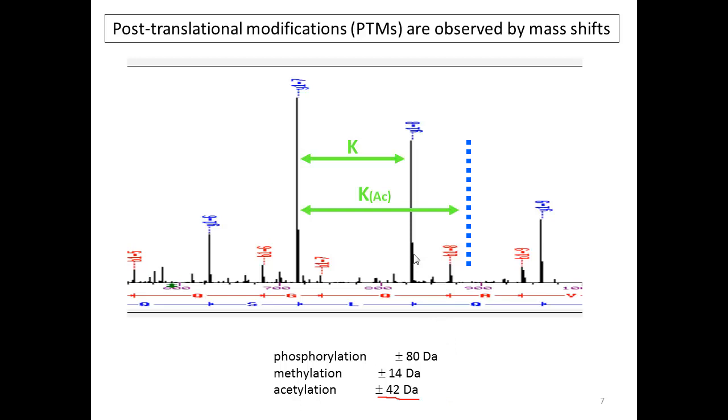In essence, the way that you identify post-translational modifications are by shifts in the spacing between successive peaks. The way that one does this calculation is one computes all the theoretical spectra for normal lysines, identifies the best matches, and then calculates it a second time with lysines being acetylated. So by considering one post-translational modification, we've essentially doubled the amount of computation we need to perform. Whichever match is best in the cross-correlation is the one that we would assign.